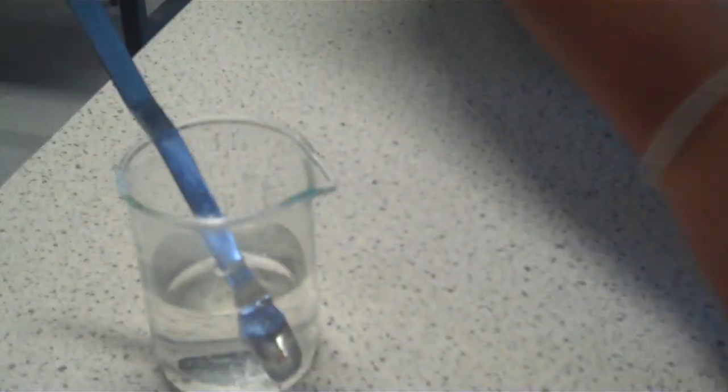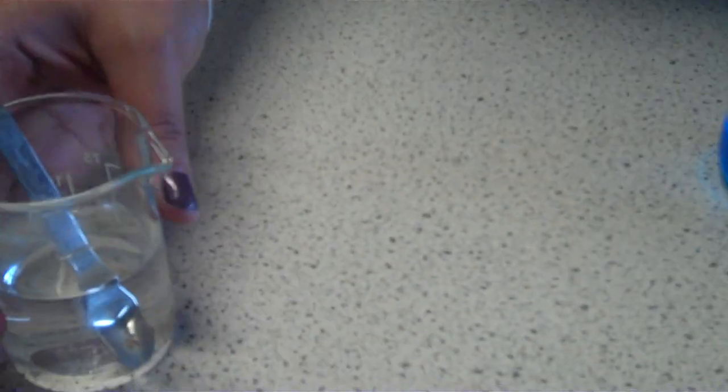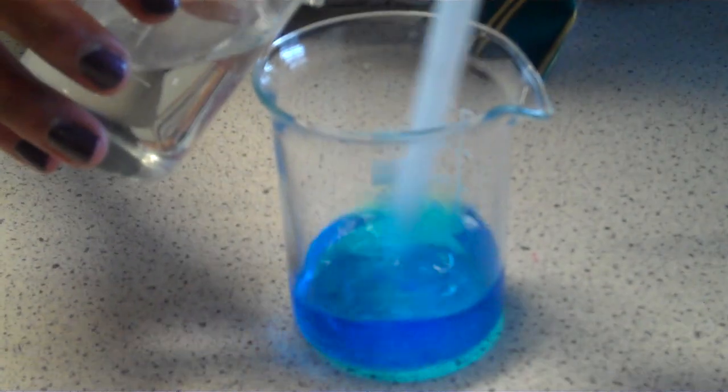Then the second solution of sodium carbonate has to be added in — this is 5.8 grams of sodium carbonate added into 55 millilitres of distilled water — and this has to be added in gradually and slowly.